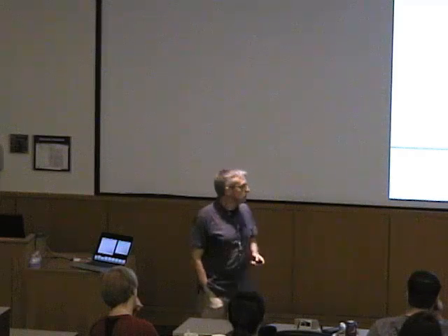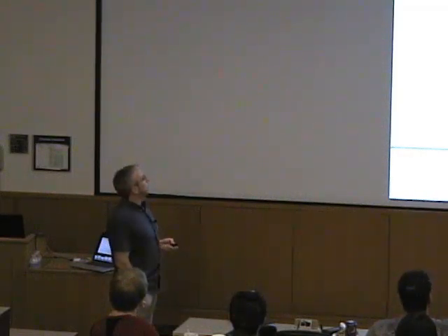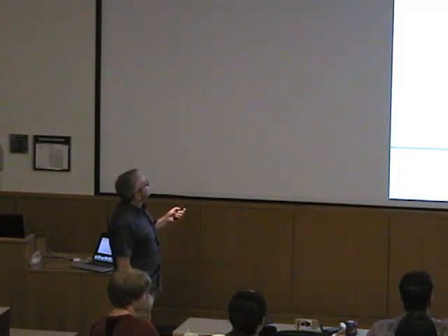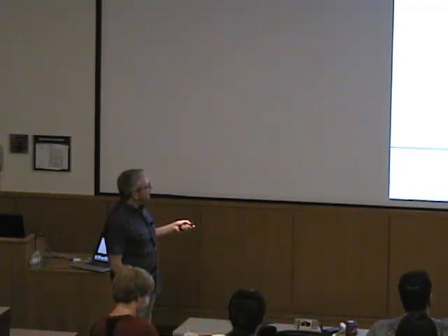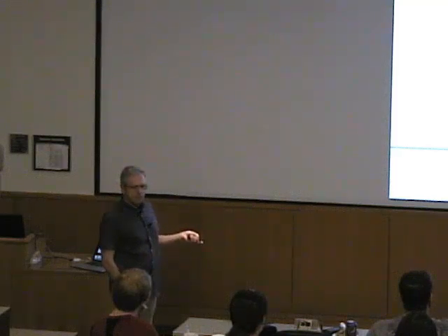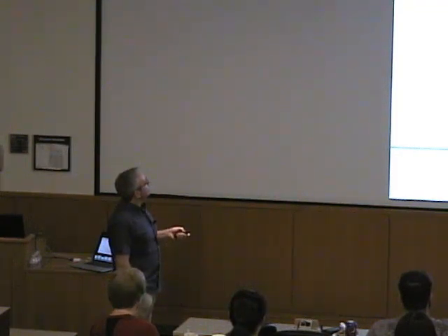So what you can do, rather simply, is you just see what you have. Well, you want to get FP. Okay, so the absolute value of FP, which is, you want to get FP, but you do only have its absolute value, which means you have a vector here that has this length that is known, and it has just some phase angle. So it falls somewhere on that circle. Okay? Then, that's the FP circle.